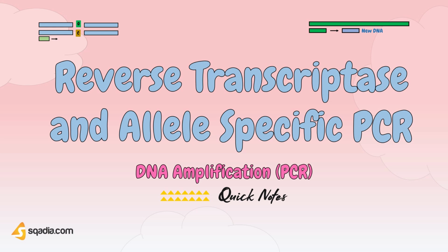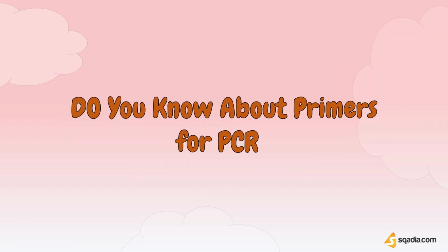In this section, we will talk about reverse transcriptase and allele-specific polymerase chain reaction. But before starting this section, let's discuss the question asked from you in our previous section. That was, what do you know about primers for polymerase chain reaction?